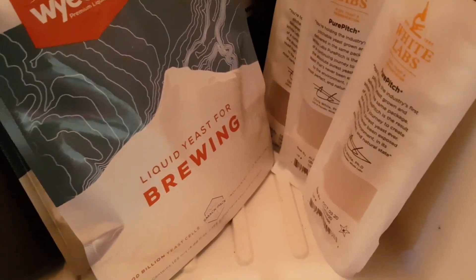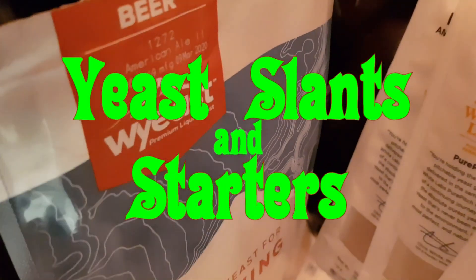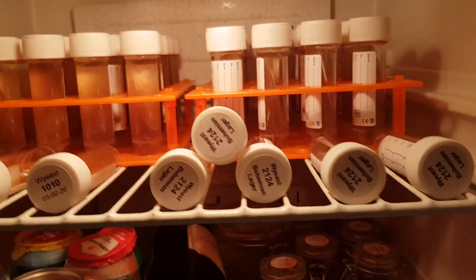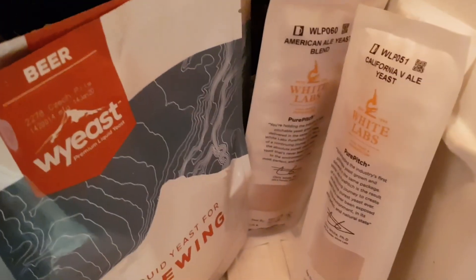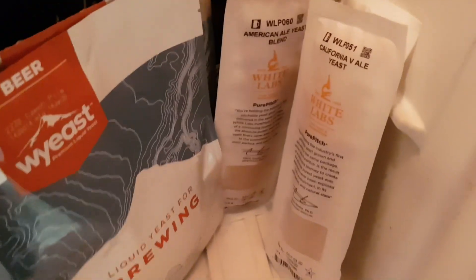I have a feeling this could turn into one of those exceptionally boring videos where you probably wish you were eating your left leg rather than watching this — but this is about yeast. These things are bloody expensive, anywhere between six and nine quid each.